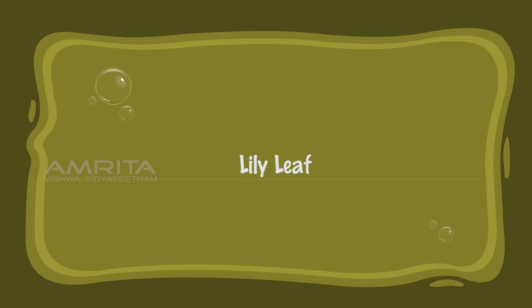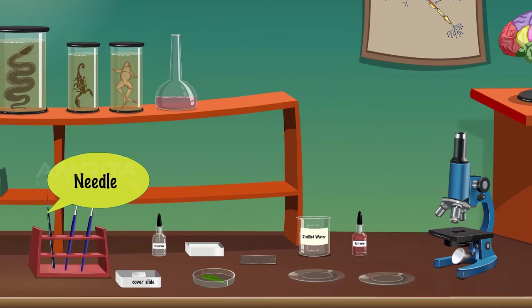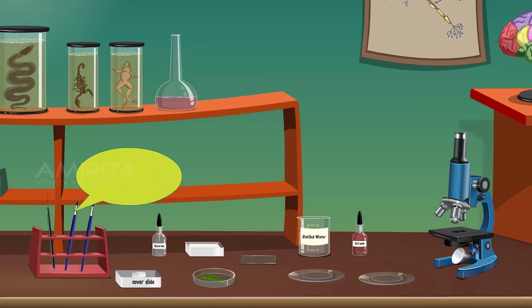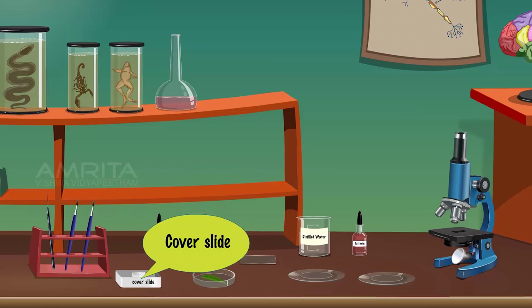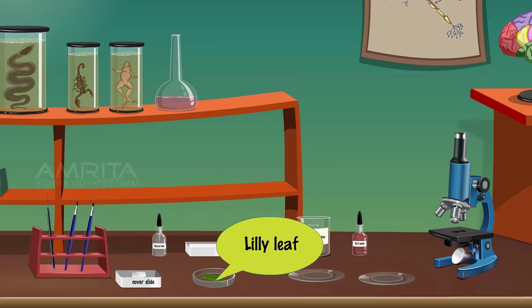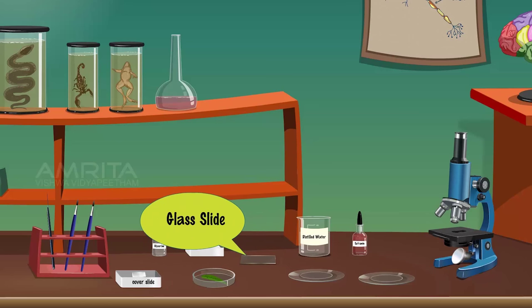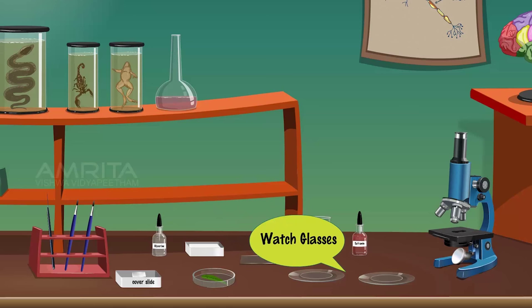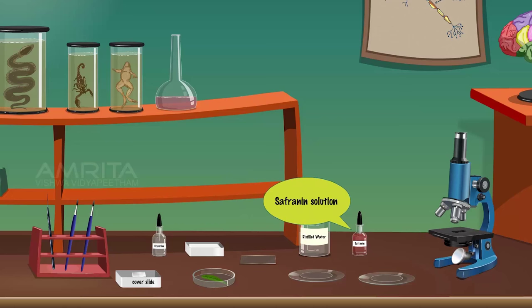Lily Leaf. Materials Required: needle, brush, glycerine, cover slips, fresh leaf of lily, filter paper, glass slides, watch glasses, distilled water, safranin solution, and compound microscope.